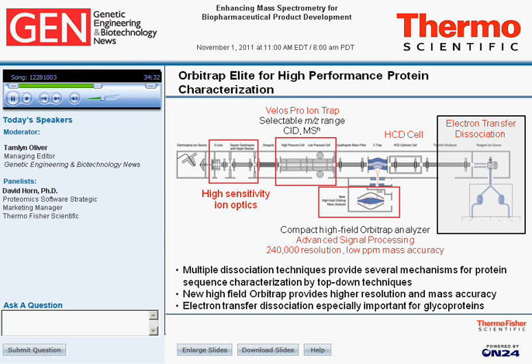Now, just as an aside, my background's in top-down proteomics, so I came out of Fred McLafferty's lab doing FTICR. And all this time, it was always nice to see 200,000 resolution on the FT, and I kind of missed it. I don't miss it anymore. This instrument has replaced the FT, in my opinion, for this type of analysis. Next slide, please.